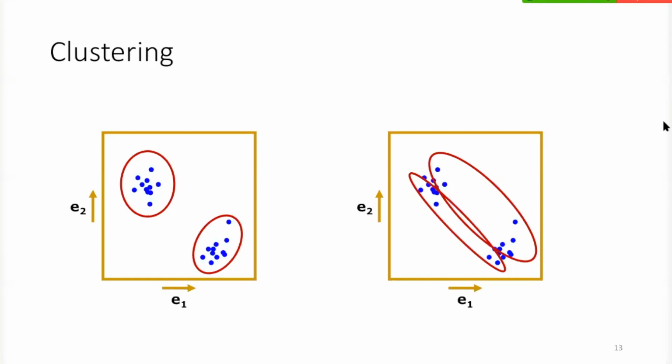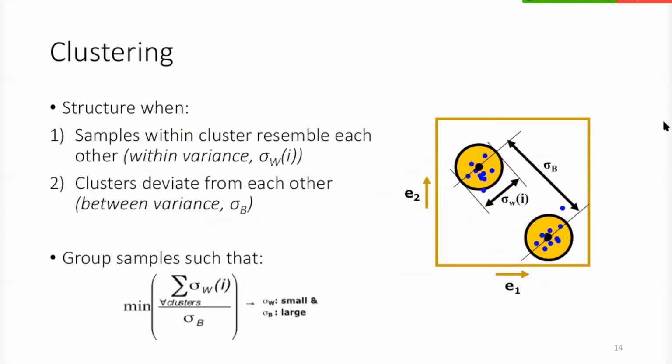So this is indeed what I was getting at. So basically distances between the dots within a circle are smaller than distances between the dots across the circles, right? So that's how you can explain this also to the algorithm, right? And that's basically what most of the algorithms try to do, right? So you try to measure some variance between your points within a cluster, some variance across the clusters, and then your goal is to minimize this function, right? That all the variances within the clusters are smaller than the variances across the clusters. Yeah. So this is kind of your objective function.